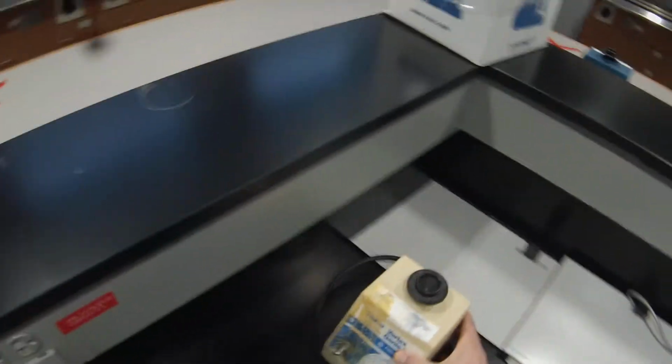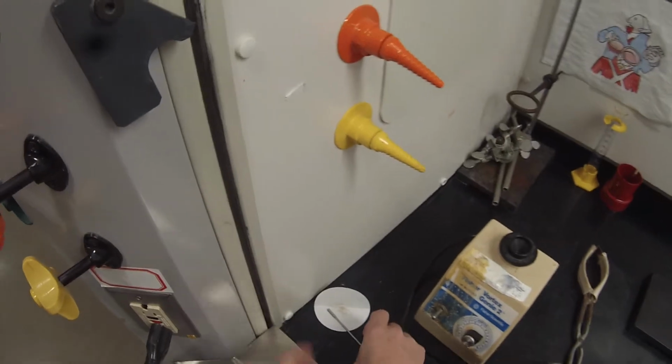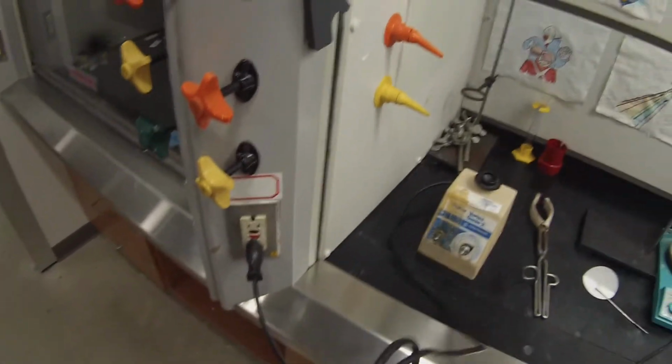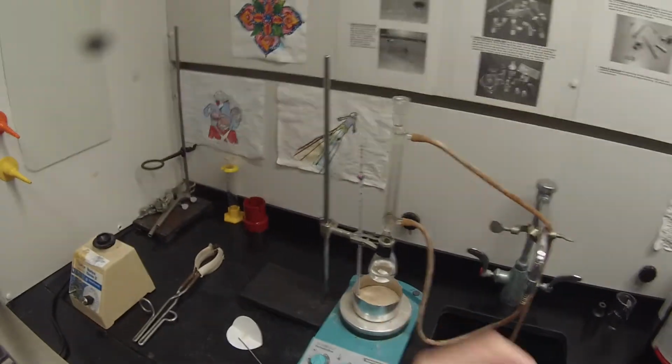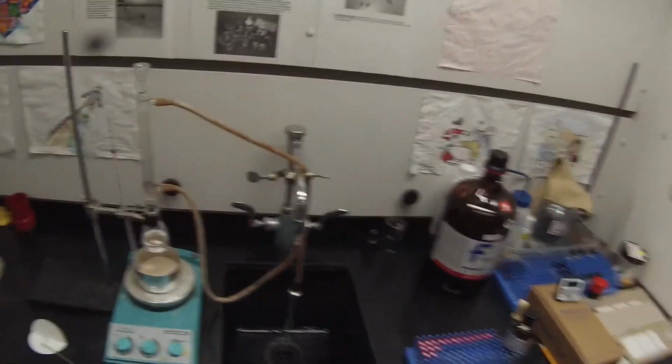But what I do need is a vortex mixer, and I might as well move that into the hood. So I'll be able to mix that every time. Here's my para-toluenesulfonic acid monohydrate waiting to be added. Ready to go when we need it. And we're at about 152. So we got just a little. And I will restart the video when I actually start the addition.